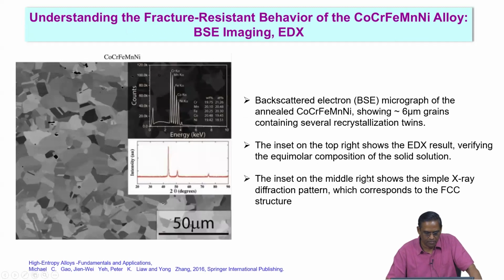And this is the BSE image, backscattered electron image. So you should know what a backscattered electron image is.